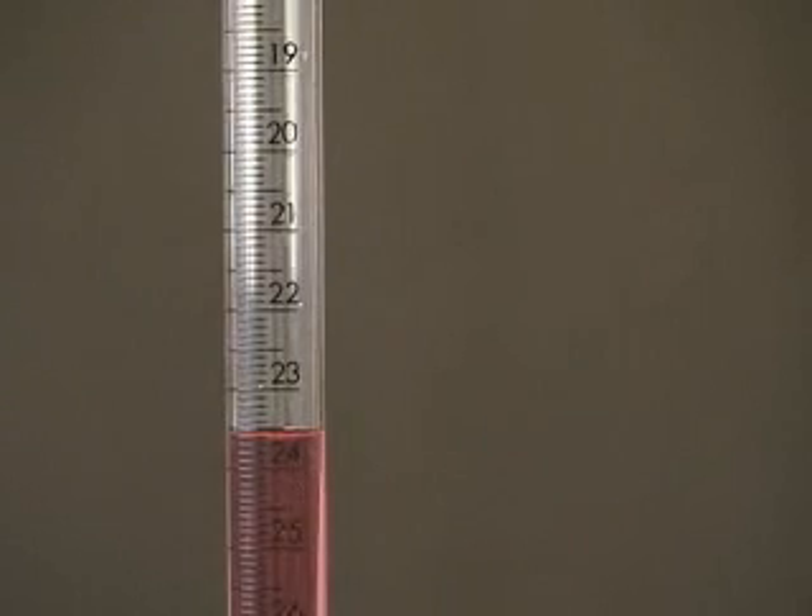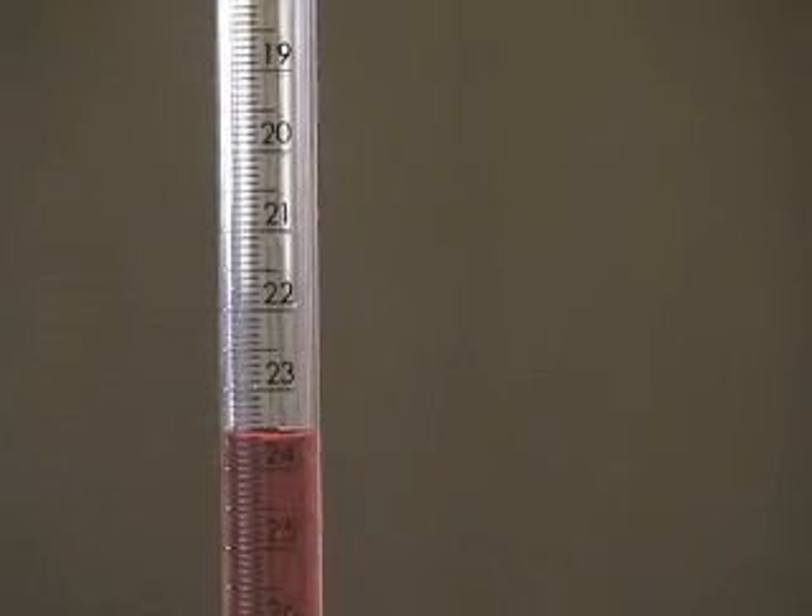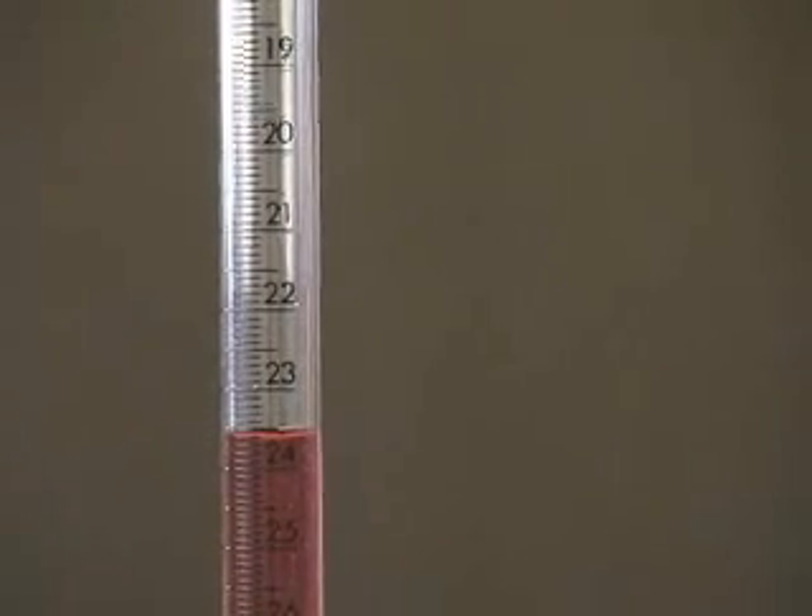If you got a reading of 23.60 or 23.62 — somewhere around there — remember that the reading of a burette or any volume like this is up to the reader. I would say that the volume is very close to 23.60.